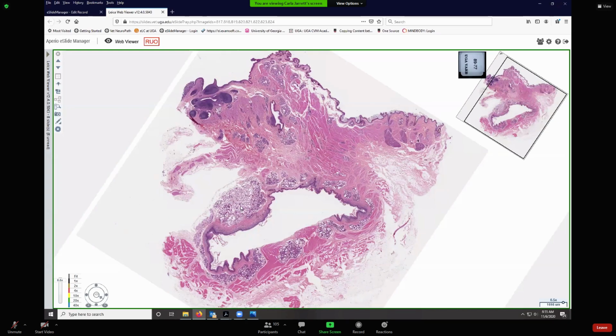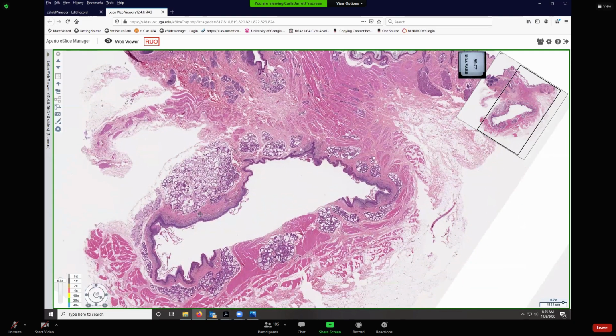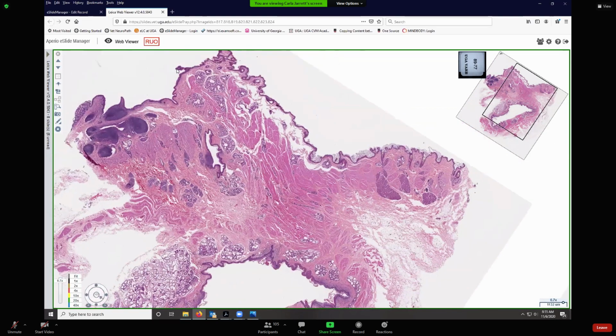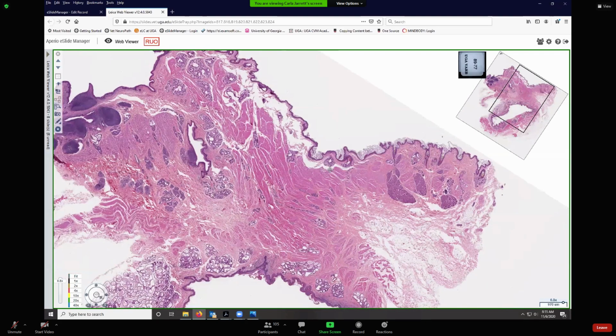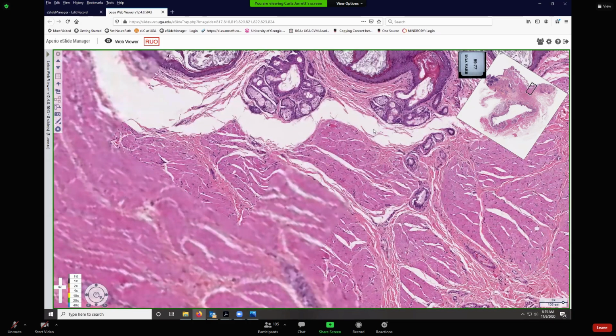We don't have a cat section, so you don't have to look for sebaceous glands down here. And that anal sac ducts out. Here's a little part of its duct right here, ducting out to the surface right here. This is just normal haired skin, so you'll have sebaceous glands and sweat glands.